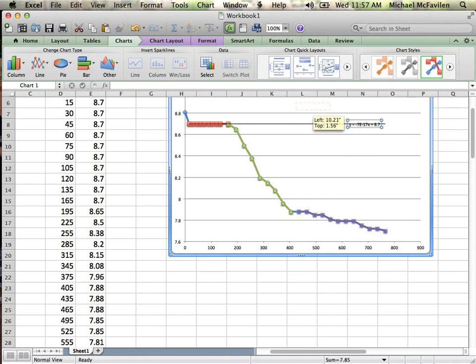You'll also notice it gives you the equation of the straight line. You now have that slope. You can calculate your y value. That y value, when using that equation, is your y or your volume initial for every one of your changes in volume, at that time. Make sense? Yes. So we don't add the zero then, just take it out of our.